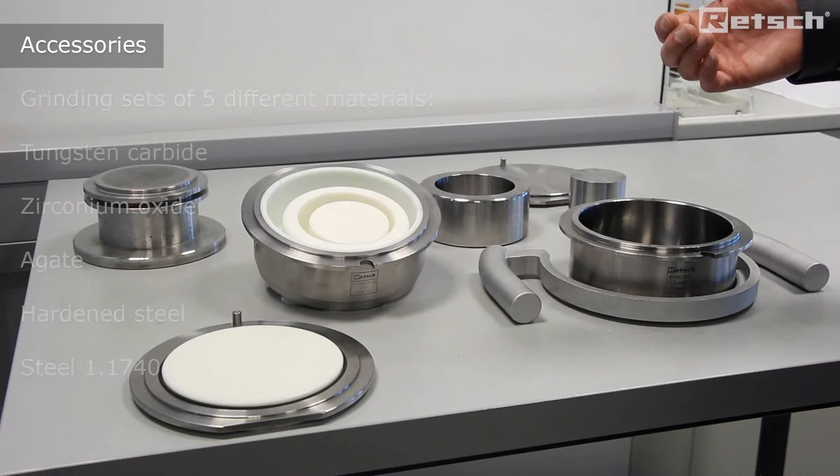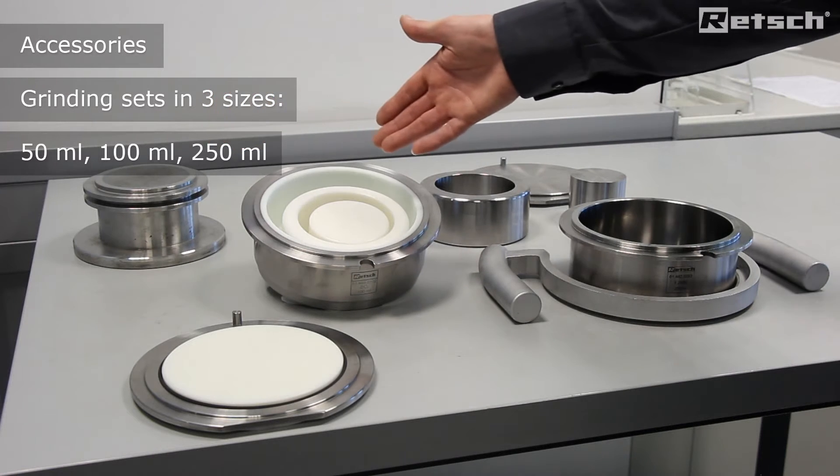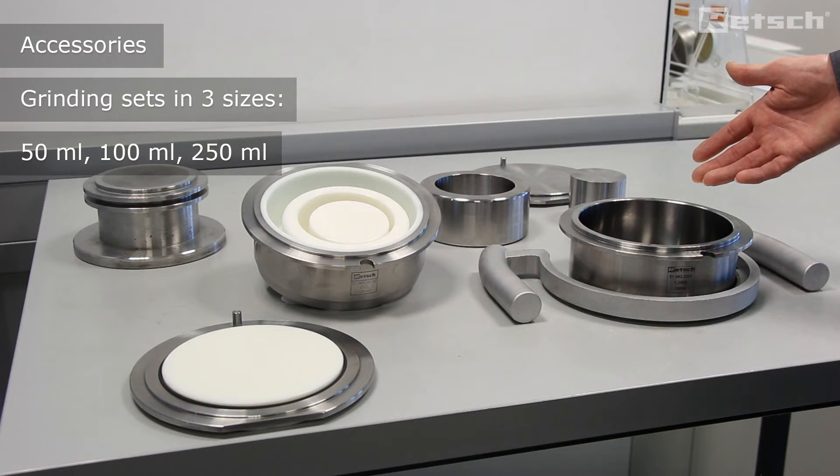Furthermore, these grinding sets are available in three different sizes: 50 millilitres, 100 millilitres and the largest which is 250 millilitres.